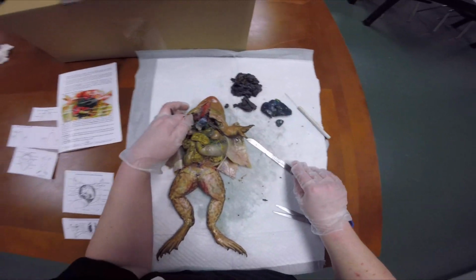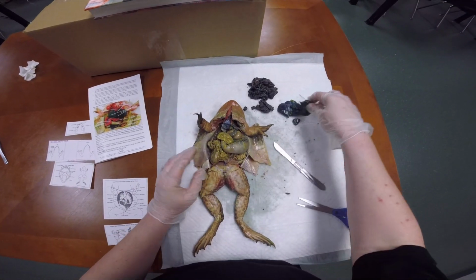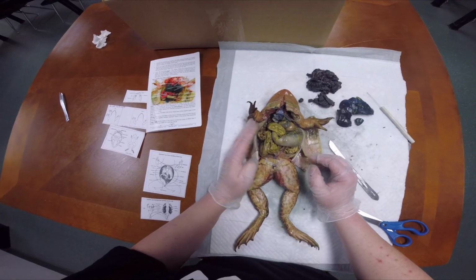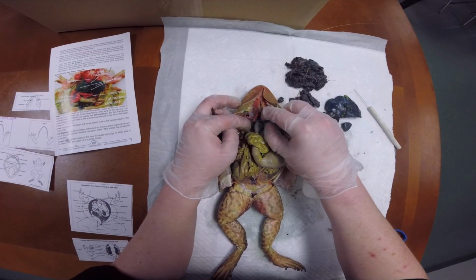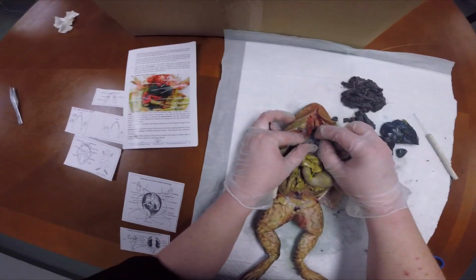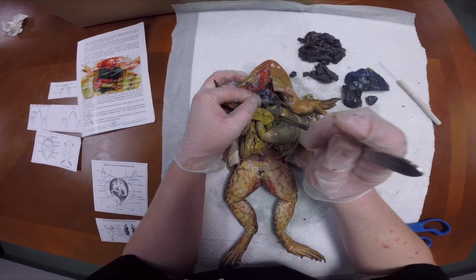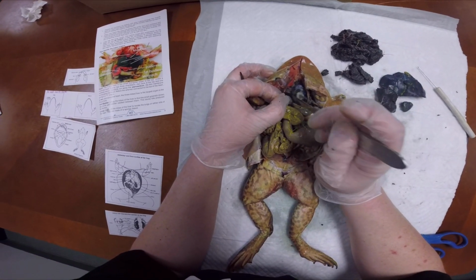Oh, I missed part of the liver, so there's more. All right, the gallbladder is hidden up here somewhere. That might be it right here, this little gray guy. That's probably the gallbladder, so let's cut it out here.